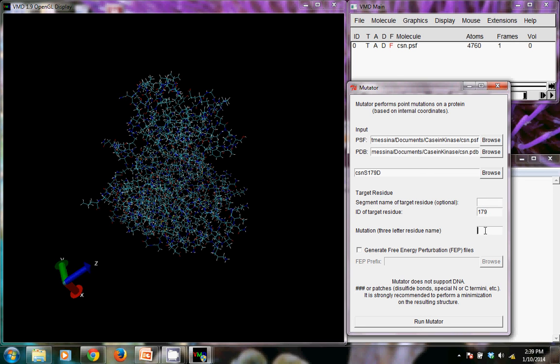And we need to give it the ASP designator for mutating to aspartic acid. And it should be that that's all we need so we can run the mutator.